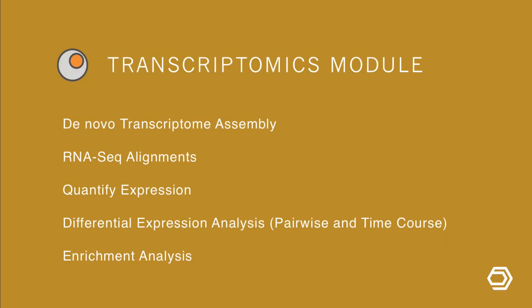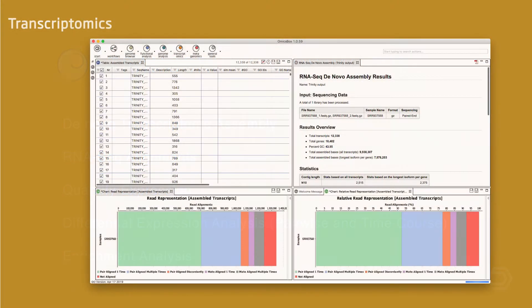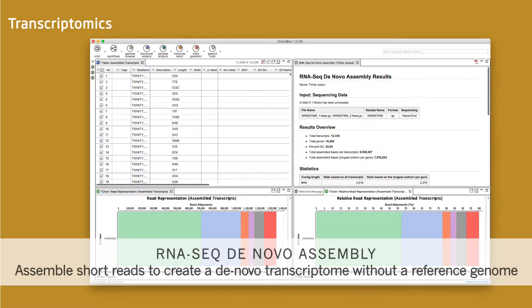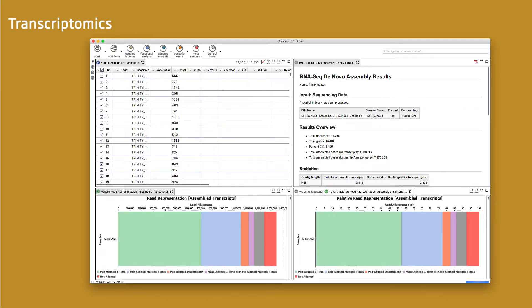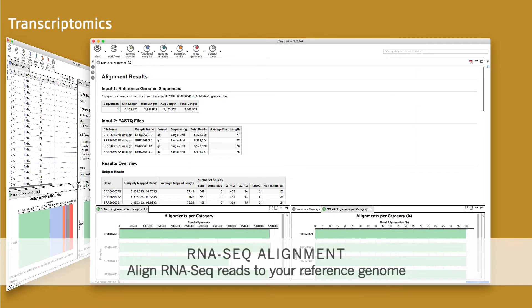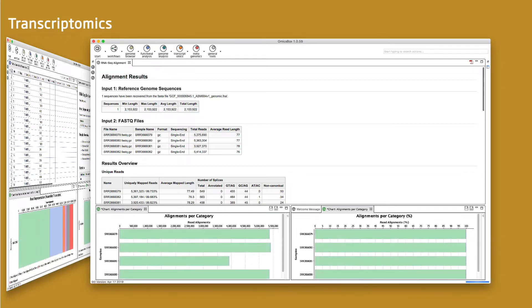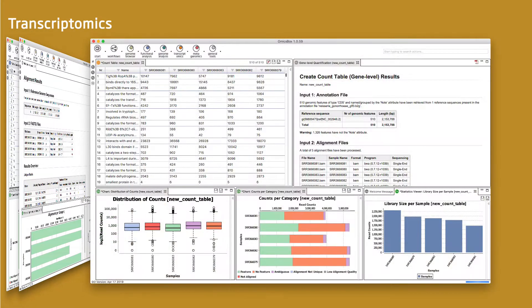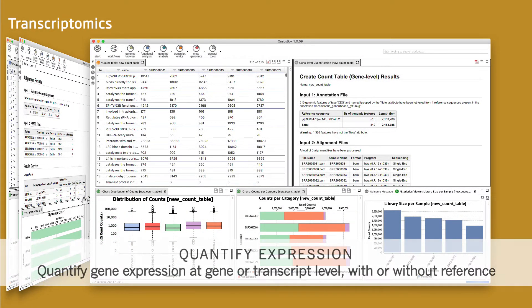Let's start with the Transcriptomics module for the analysis of RNA-seq data. This module covers the whole analysis pipeline for transcriptomic analysis, including de novo assemblies as well as reference alignments. The module allows to work with and without a reference genome. The quantify expression tools work at gene or transcript level and with or without a reference genome.